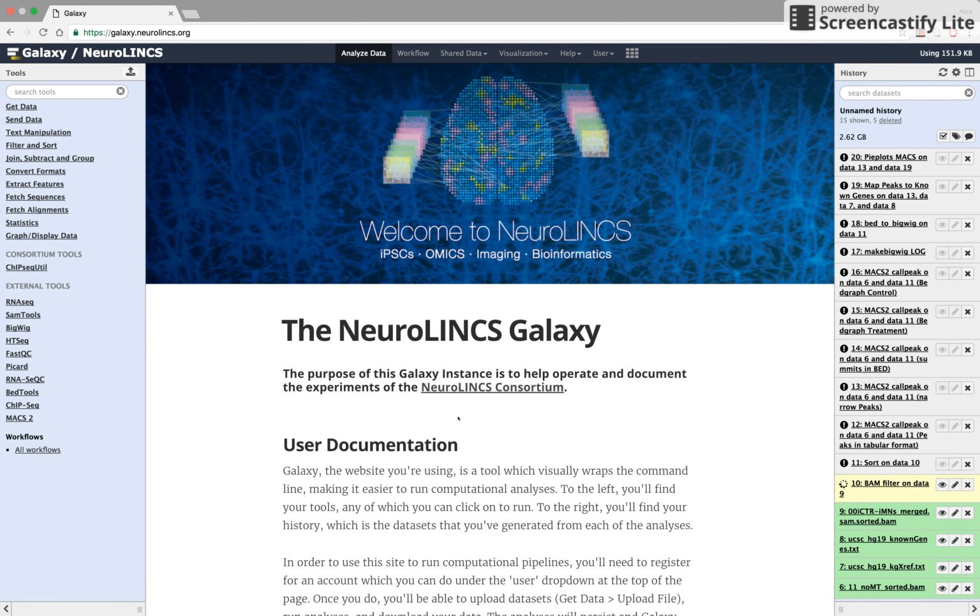So that concludes this tutorial. And as you can see, this job is just starting.